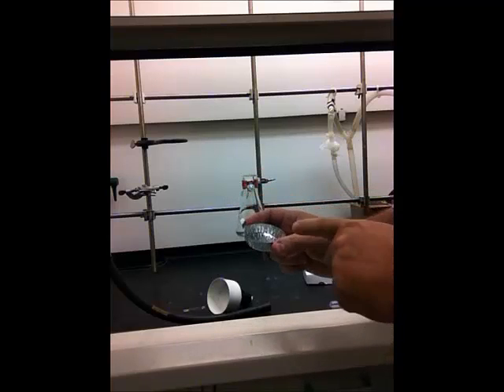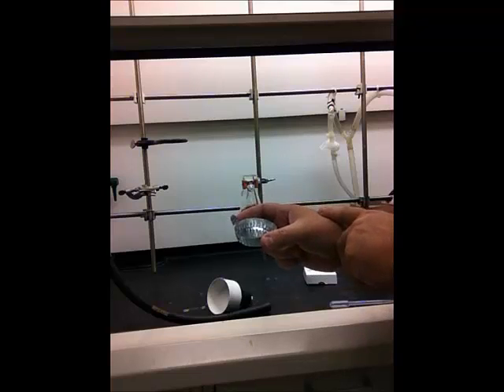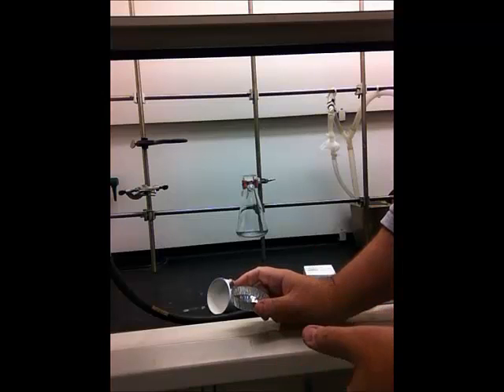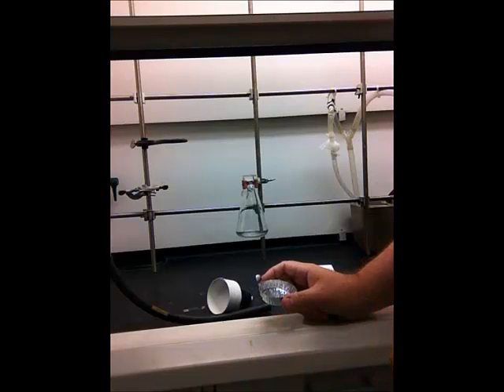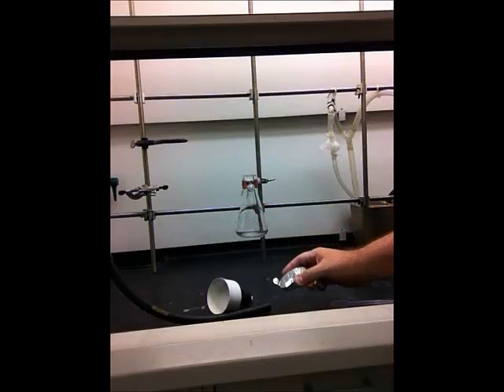Write your name on the underside of the aluminum dish before you put it into the oven. Make sure that bare crystals — not filter paper — are in the aluminum dish before placing it in the oven. When retrieving your sample, always check the name on the underside of the dish so you don't accidentally take someone else's crystals. Always put bare crystals directly on the aluminum dish.